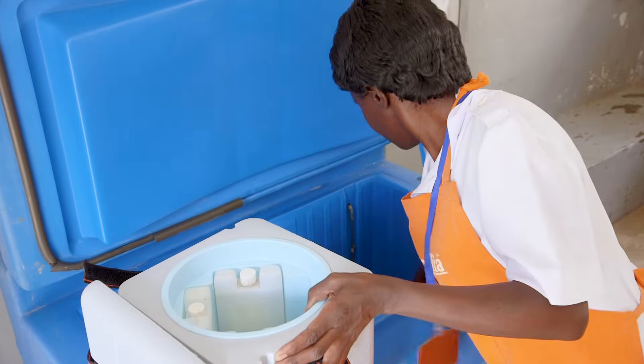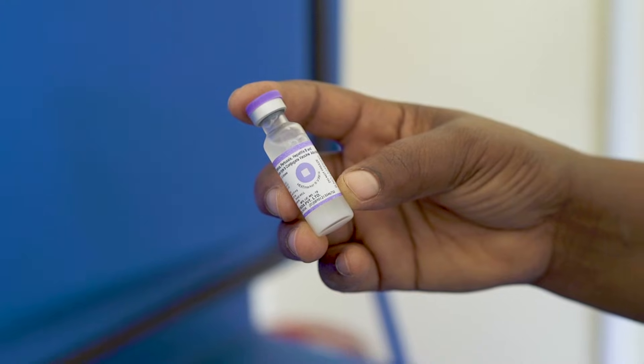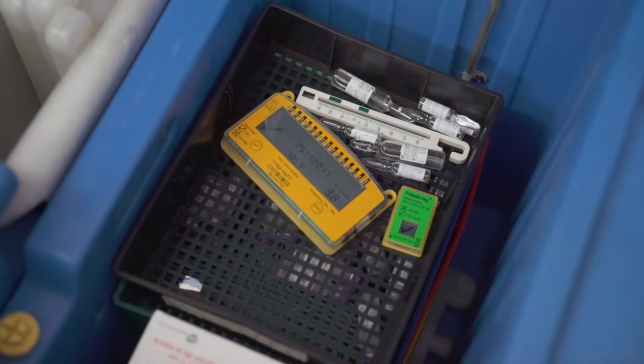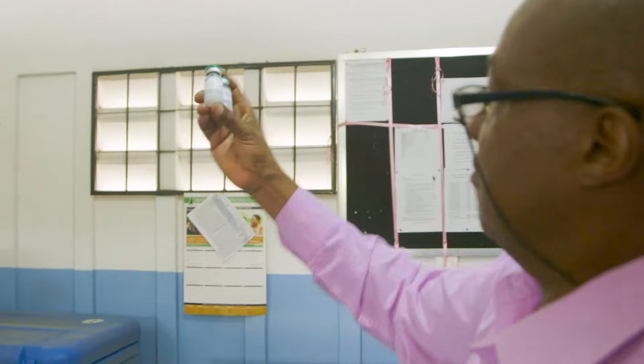Some vaccines are sensitive to freezing. Once they have frozen, they should not be used. Fortunately, there is a way to tell if a freeze-sensitive vaccine has been damaged by exposure to temperatures below zero degrees Celsius: the shake test.